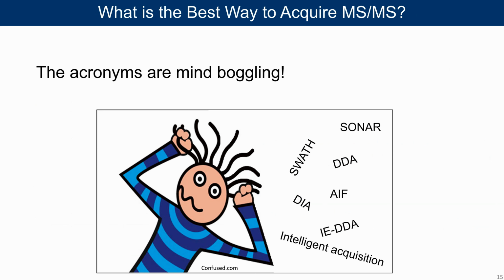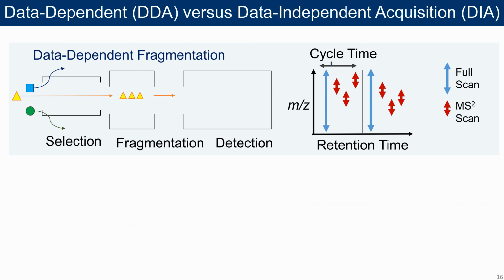But you may ask, if you're familiar with mass spectrometry, what about data-independent analysis? What about all-ion fragmentation? What about SWATH? What about SONAR? What about all the other techniques where, instead of selecting ions, you fragment everything simultaneously? In data-dependent fragmentation, you take one ion, you fragment it, and you look at those fragments.